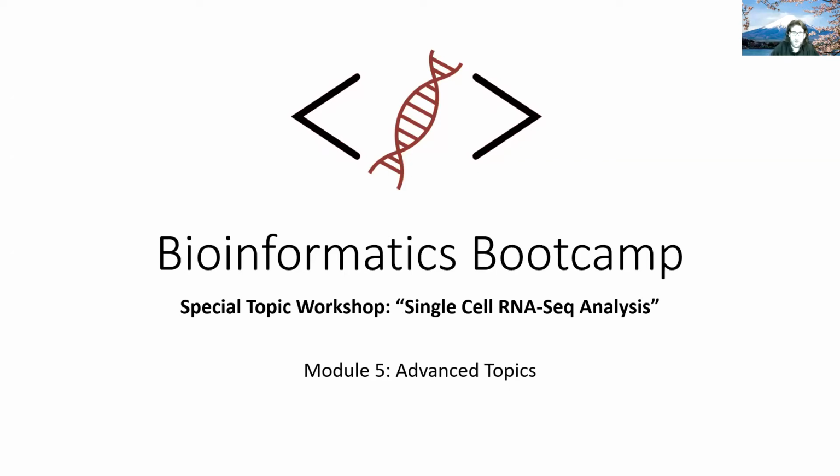Today we're going to be talking about advanced topics in single cell analysis. These are the things that you might do after you've already got your UMAP and your clusters and your cell types assigned. These are the sorts of things that can really bring out the best in a data set and really allow you to dig deeply into the biological meaning behind your results.